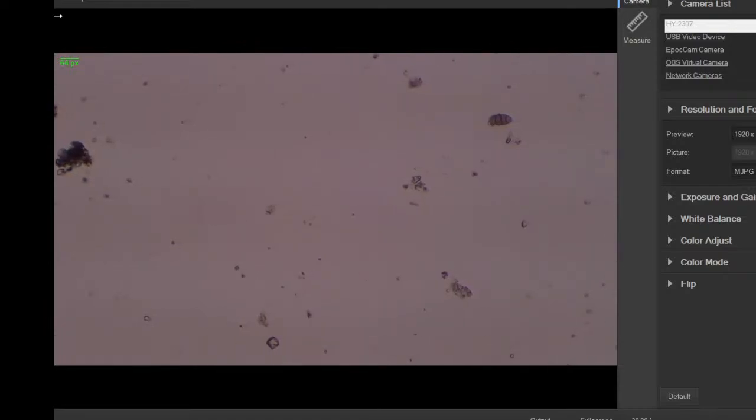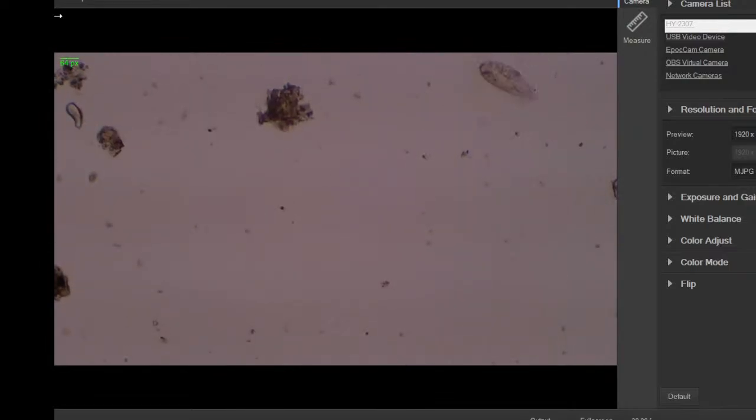There's the spiky guy again. He's right near one of those, it's like a sporangia thing. Alright, he's not slowing down, so let's try a guess here and see if I can get lucky. Still kind of near the middle here. So if I can trace him. Yeah, he's taking big movements now. It's that little thing again. I lost him.